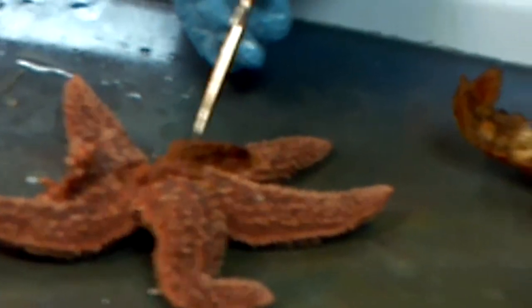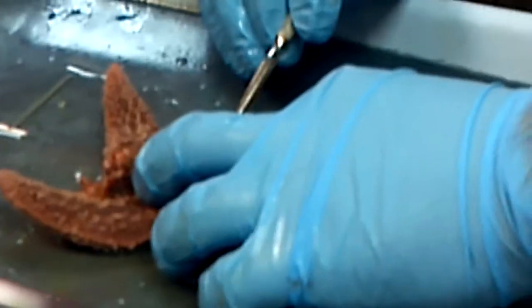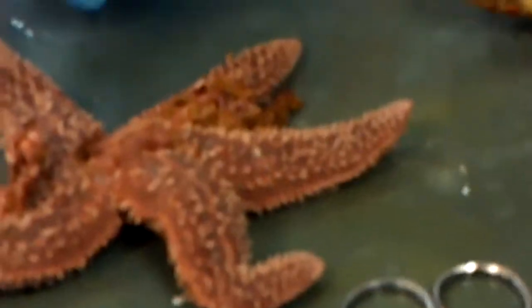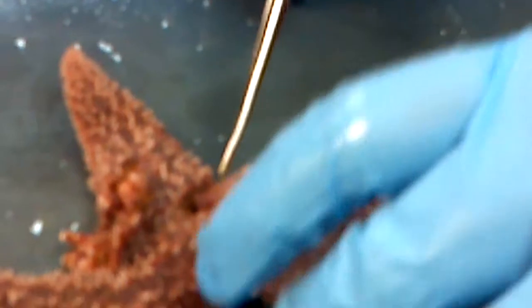This is digestive glands, and if we pull them up, underneath are the gonads. This one doesn't have very many gonads, actually — here's some gonads right there. The digestive glands are very greenish-orange and the gonads are very red. They extend into the arms, whereas the cardiac stomach is just in the center. So here's the cardiac stomach, and then just below it are your gonads.